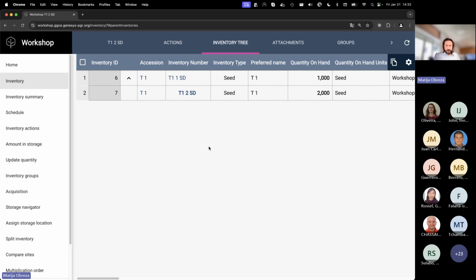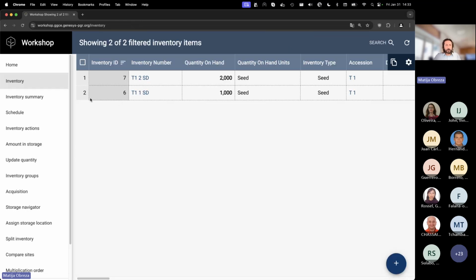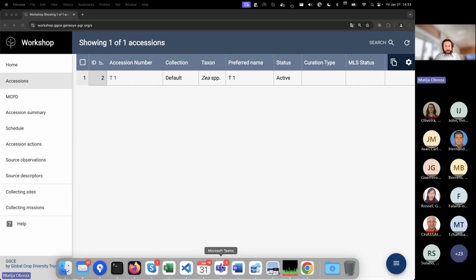With that, I think, Juan Carlos, you can show some of the practical tools. So instead of doing things by hand like I've done now, what we want to do is show some of the tools in the system that allow all of these edits that I've done to be a bit easier and quicker. So with that, Juan Carlos, please take over.